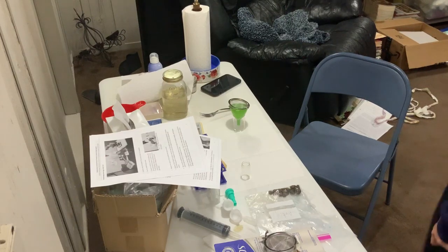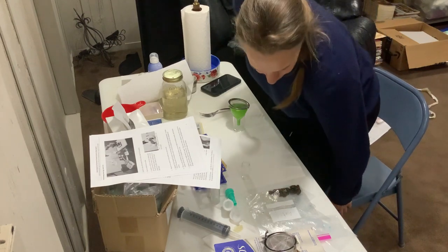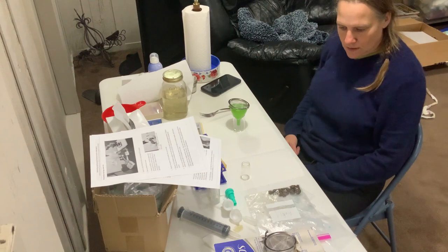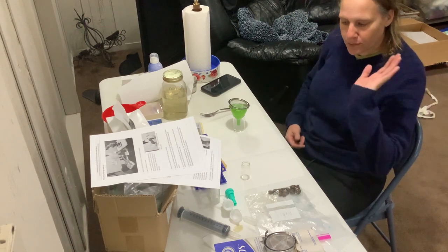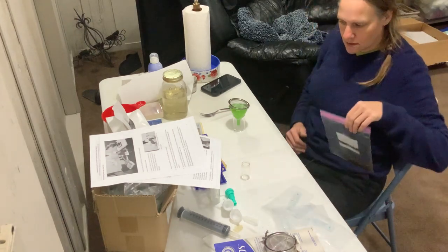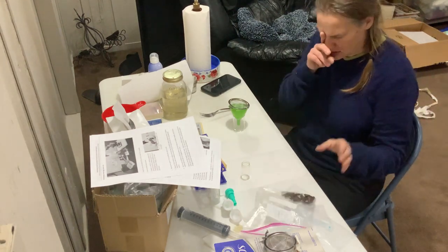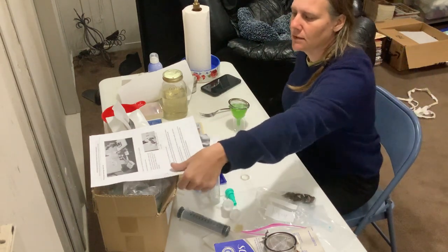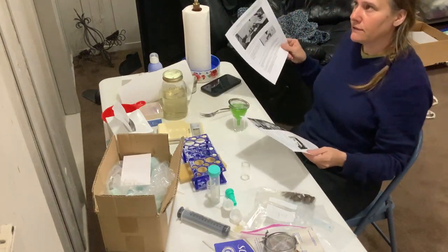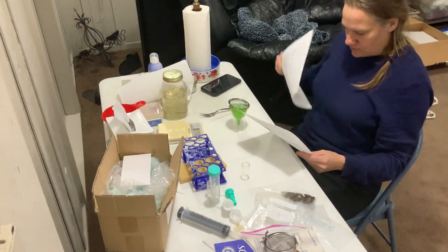Okay everyone, let's get started. What I'm doing today is a fecal exam. We're going to do it on Audrey. I want to get a before count, before she lambs, and then I'll get an after count. Her FAMACHA went way down after she lambed, so she's probably under a lot of stress. There's supposedly two weeks after they lamb that their immunity goes down, so you're going to watch it before and then after.